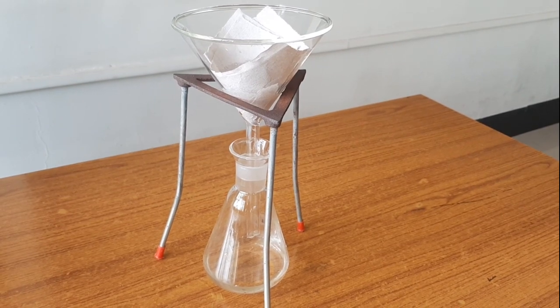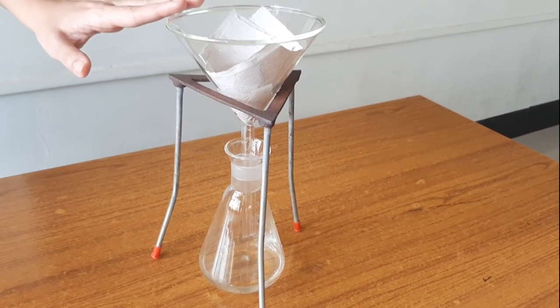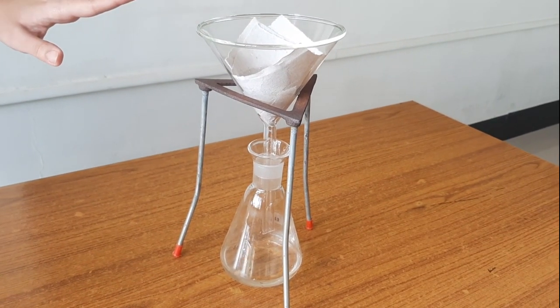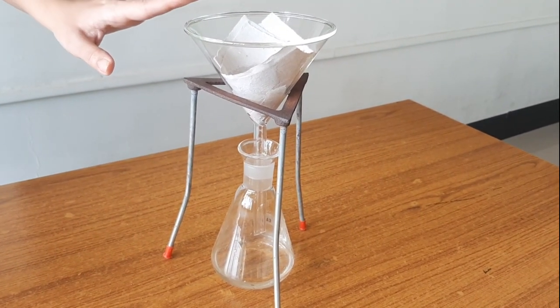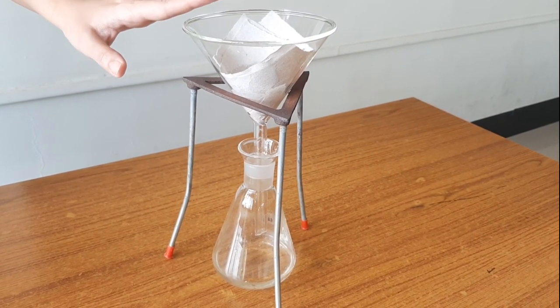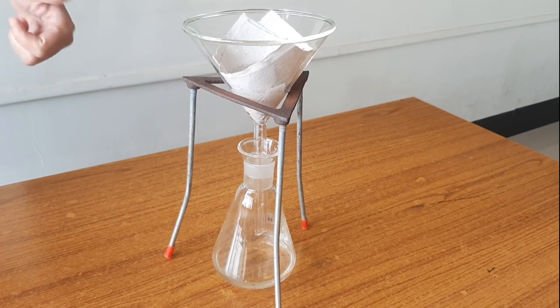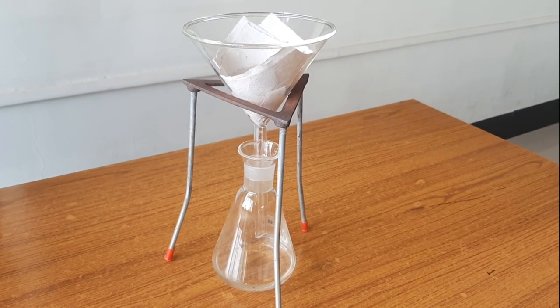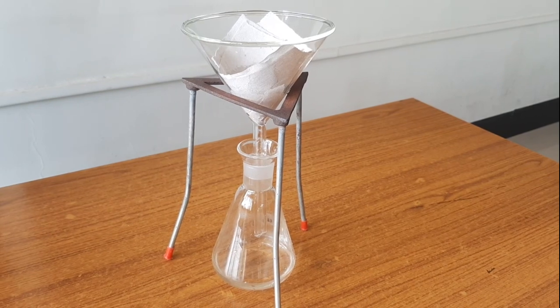So our first filtration through funnel A was completed within 3 minutes and 35 seconds.